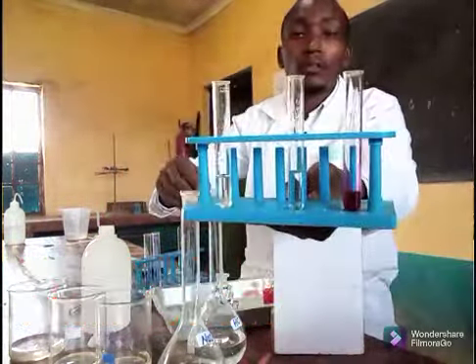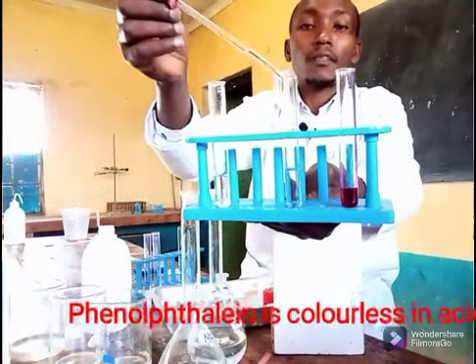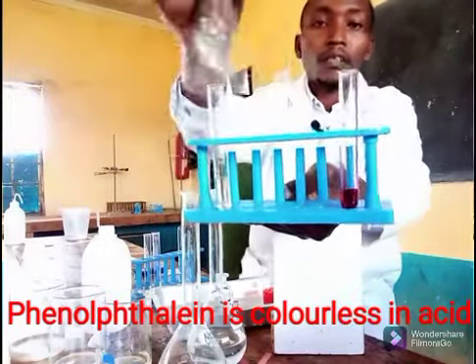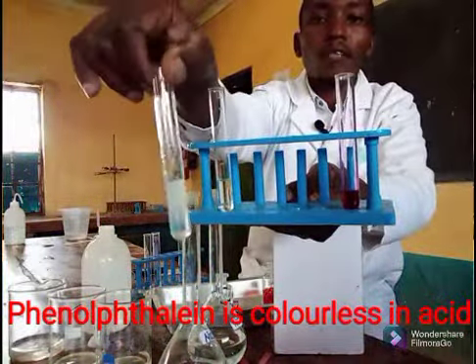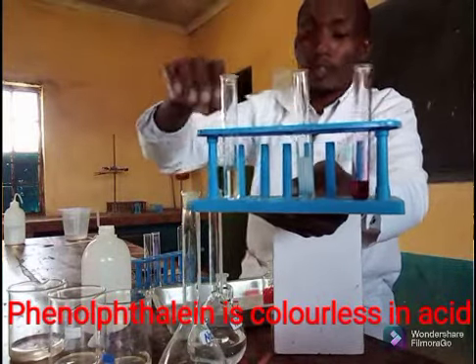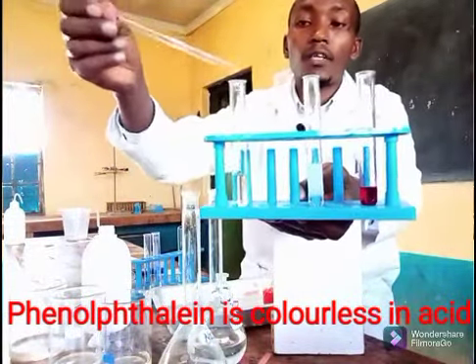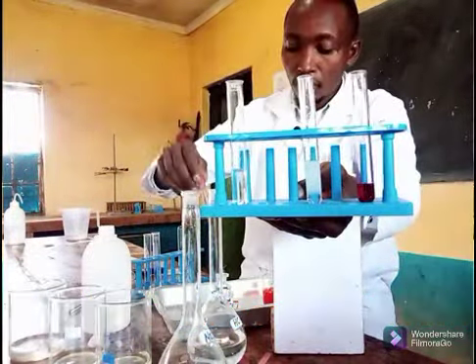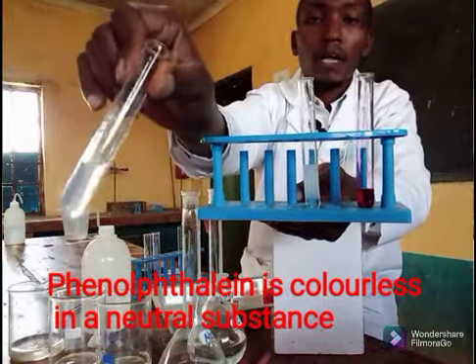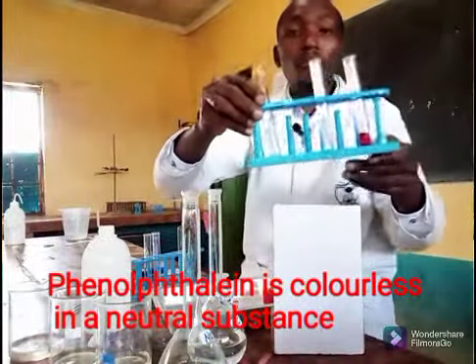This is phenolphthalein in an alkaline solution. I'm going to introduce an acid, phenolphthalein in an acid. As you can observe clearly, it has remained colorless. Then finally, I will add phenolphthalein in a neutral solution, or a substance that is neutral. Yep, it has remained colorless.